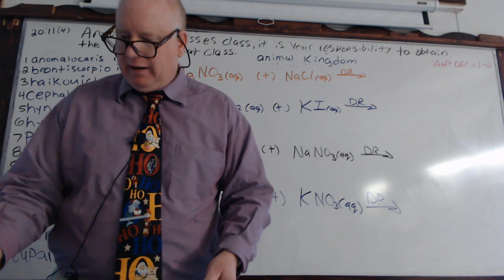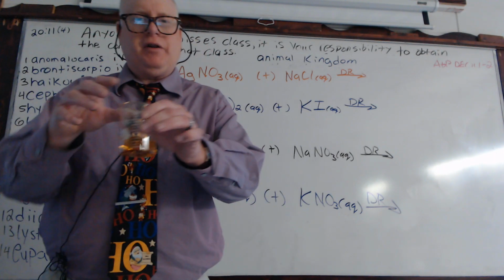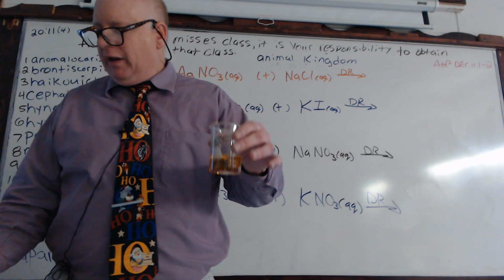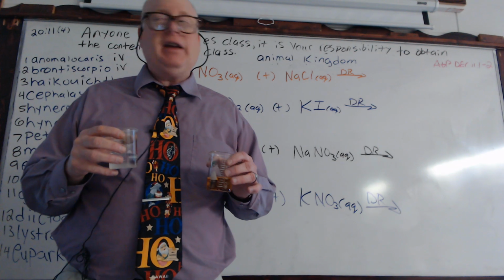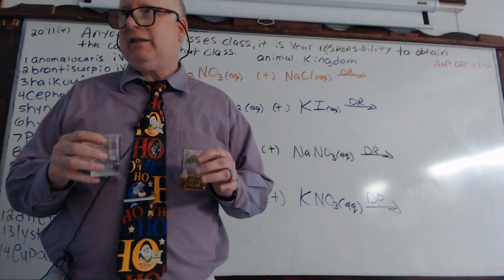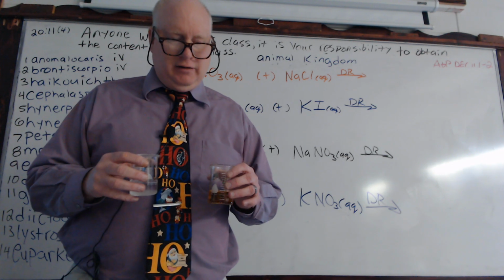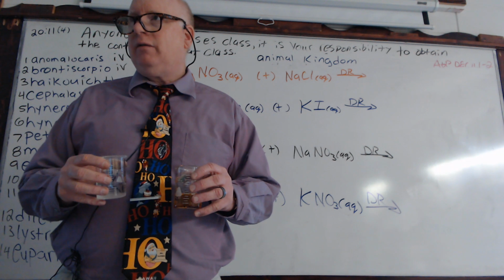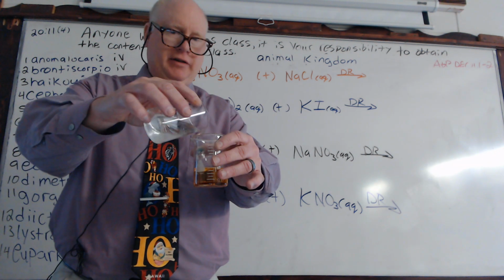So that's why with this iron 3 chloride, it's still continuing. There's still some tiny particles down in here. And then what do we know about nitrates? Are they soluble? No. Yes, there are no exceptions. It's soluble. Correct. So now, what happens if we pour one into the other?